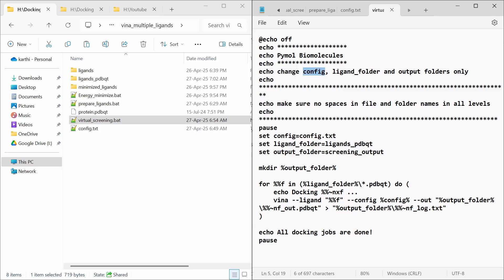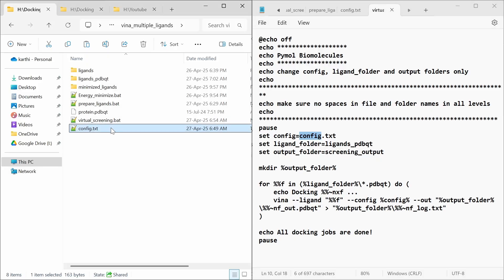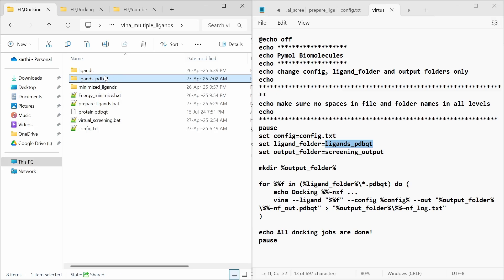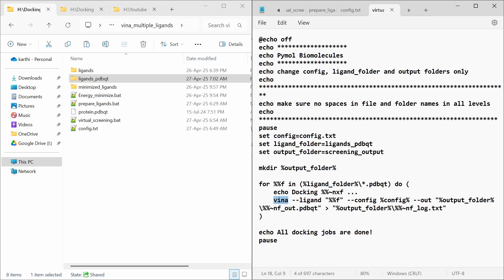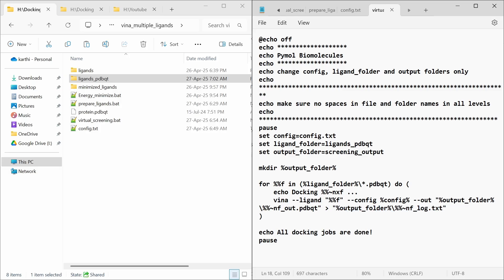This is the virtual screening batch file. Here you have to change the config file, ligand folder, output folder, etc. This is the screening output folder — this folder will be created. You can see the Vina command. If the environment variable is not set, you have to specify the full path to the vina.exe file. The log file will be saved as log.txt. Now double-click the virtual screening batch file to run it.